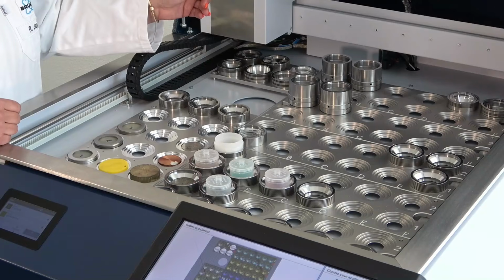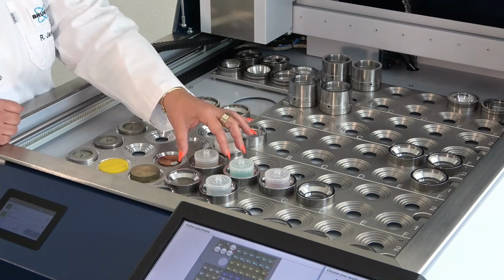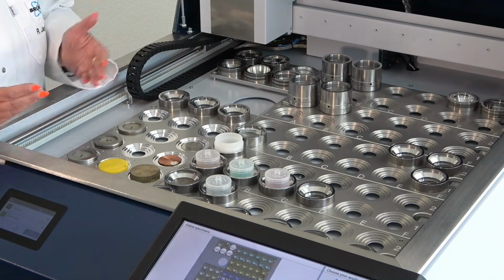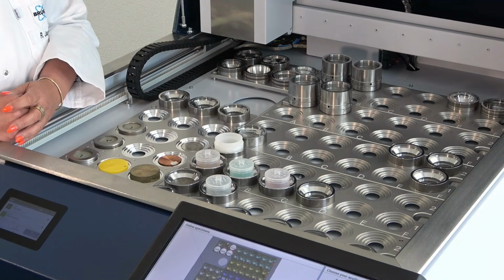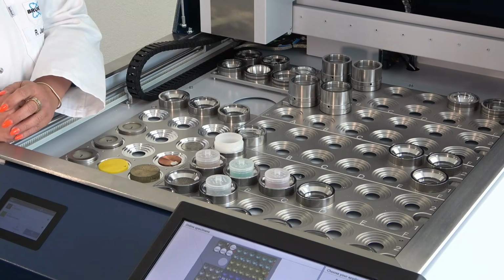This is avoided by the AI-based camera in the grabber. The grabber or the camera will detect that a liquid cup is loaded and automatically the vacuum is forbidden. So there's no chance that by any false use of the software, the user can load a liquid sample for a vacuum measurement.